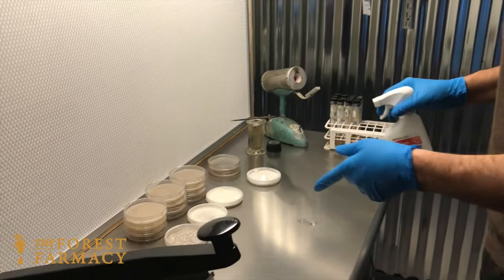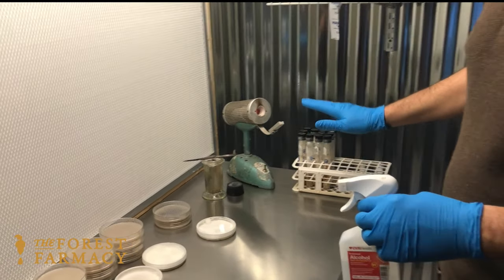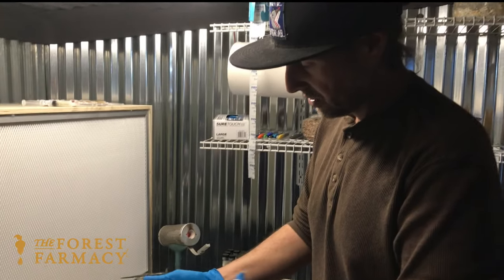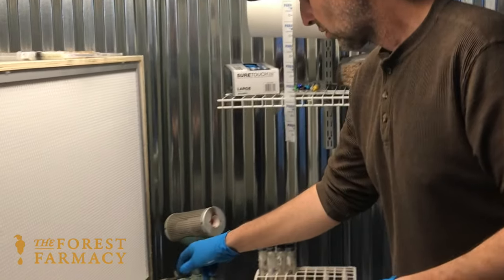You can also see I have some slants — these are our backup cultures. I have four different species that I'm going to transfer. Obviously you want to make sure everything's clean, so once you get everything clean everything else has already been sprayed off at least two or three times.